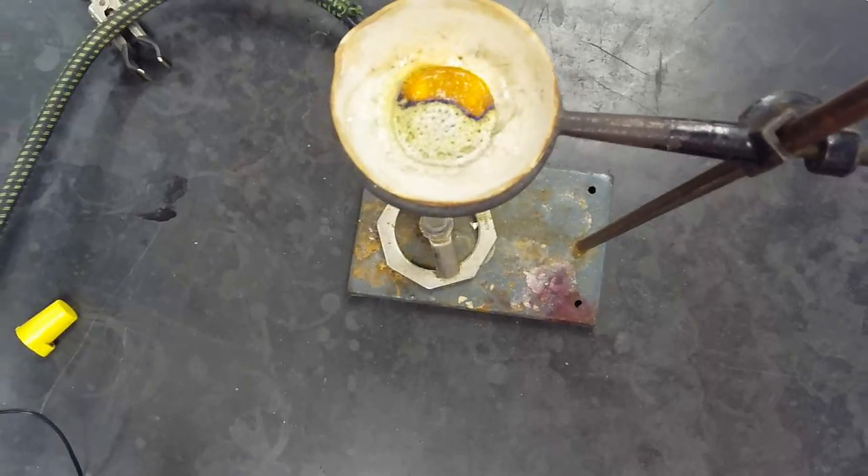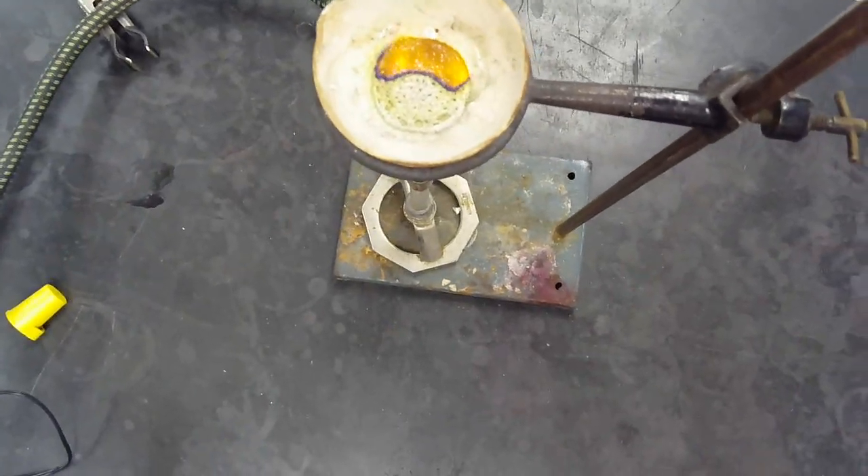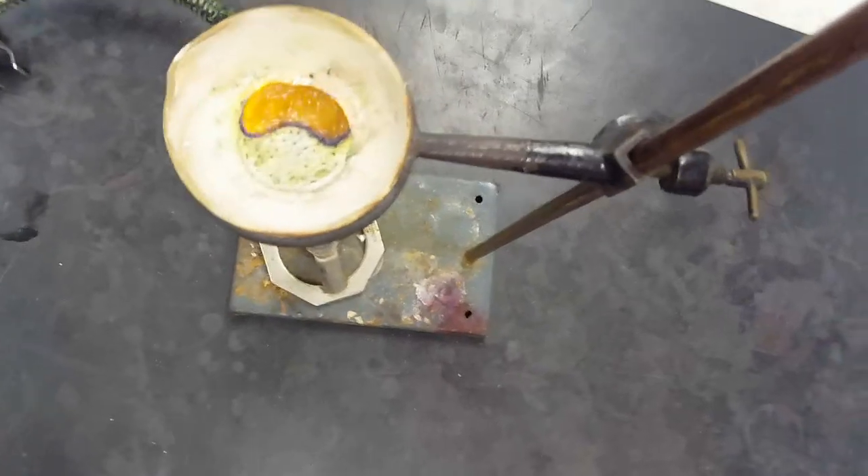Uh-oh. Houston, we have a problem. What do you think is going on? I've actually shown you this before — see what you can think of.